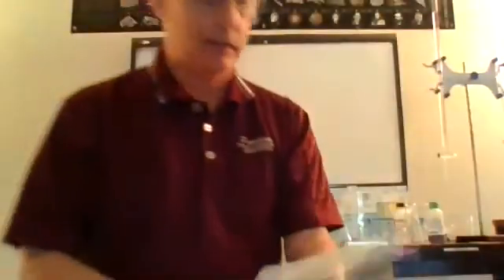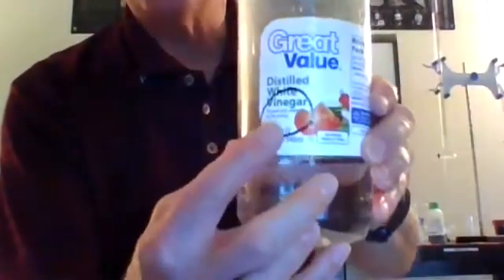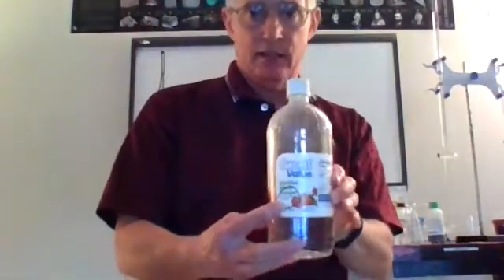Okay, so today, I'd like for you to get out your packets, please, and get out lab number 2. This is where we calculate the percent by mass of acetic acid in vinegar. And this is great value. If you take a look right here on the package, you're going to find a statement that says diluted with water to 5% acidity. That means it's 95% water, only 5% acetic acid, called vinegar.